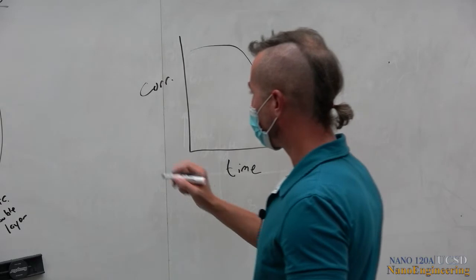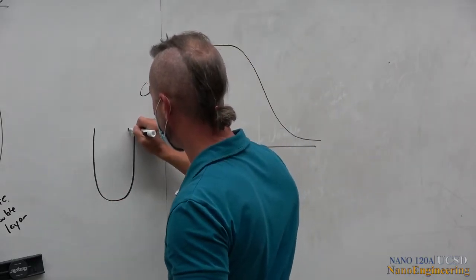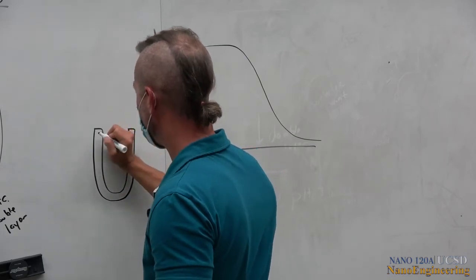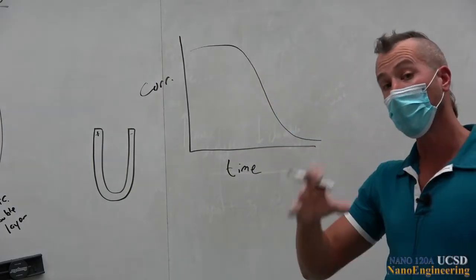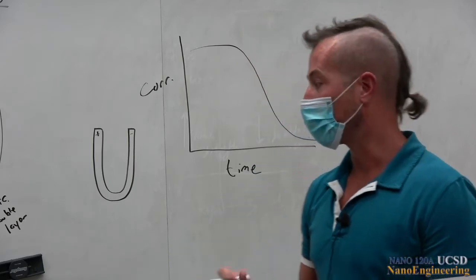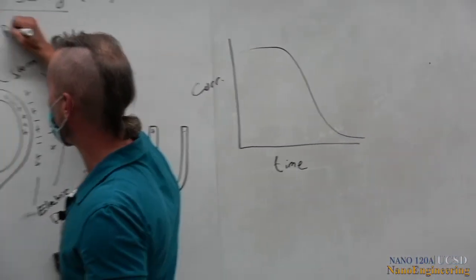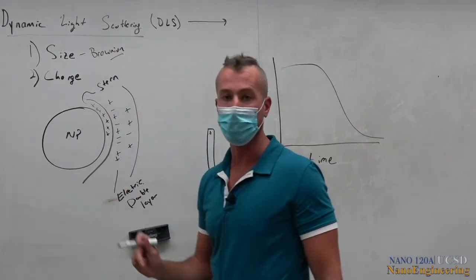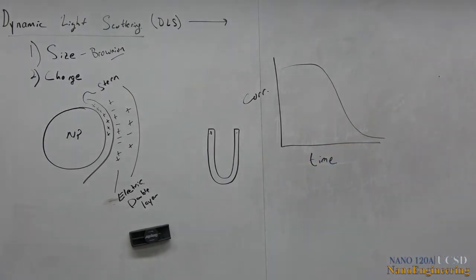And so we're going to have this little capillary. This is what the sample looks like. And one end is positive and one end is negative. And we're going to artificially induce some movement. So remember, when we were doing size, we were only looking at Brownian motion. And here we're going to look at electrophoresis. I'm going to show you.